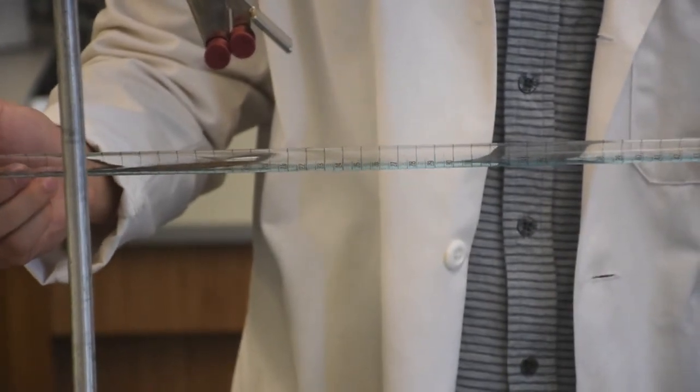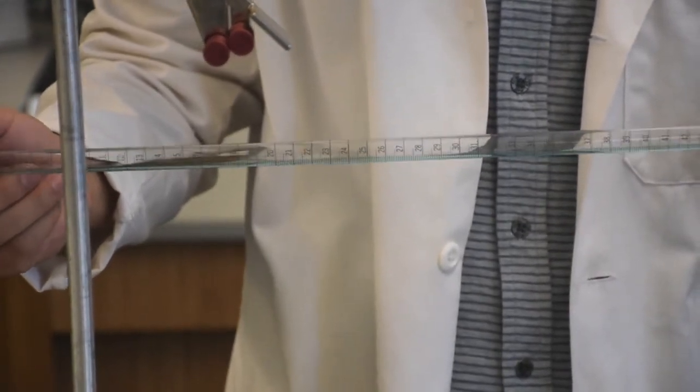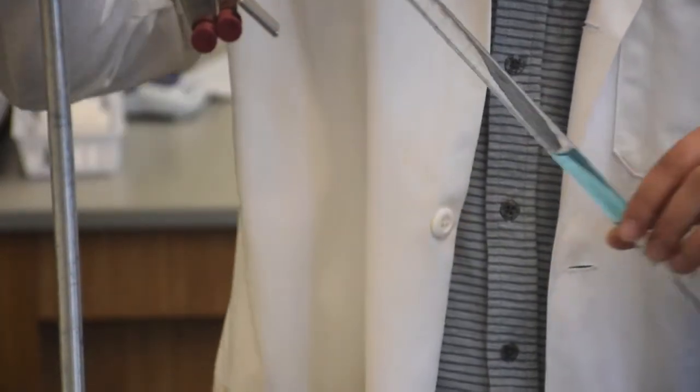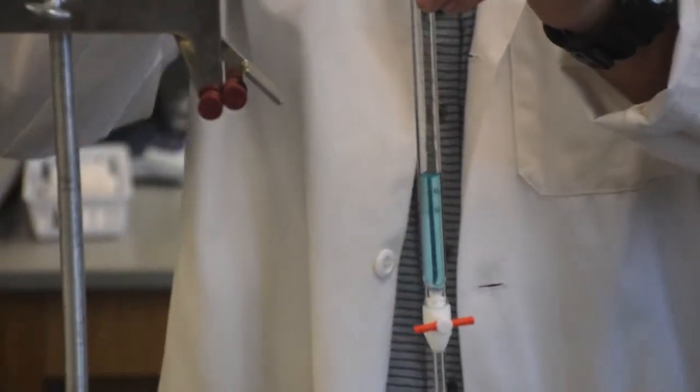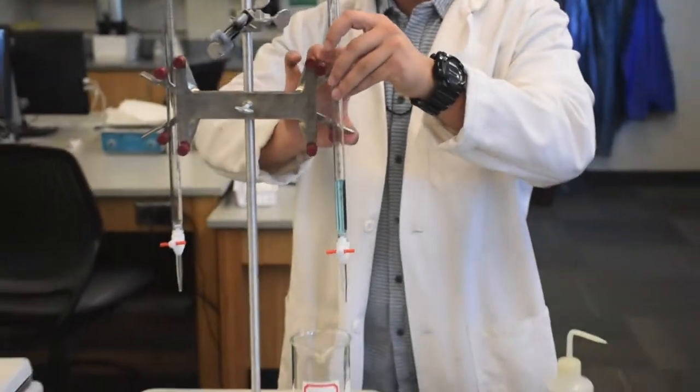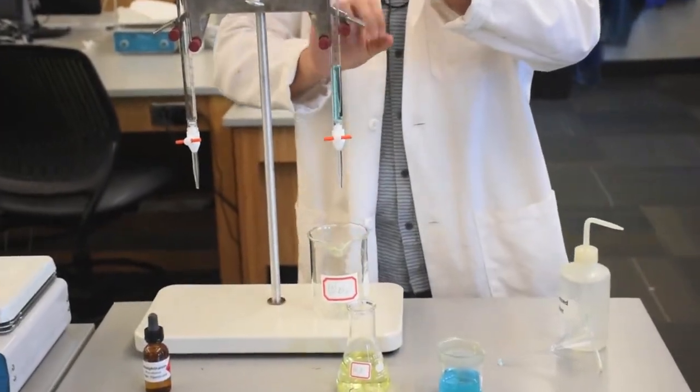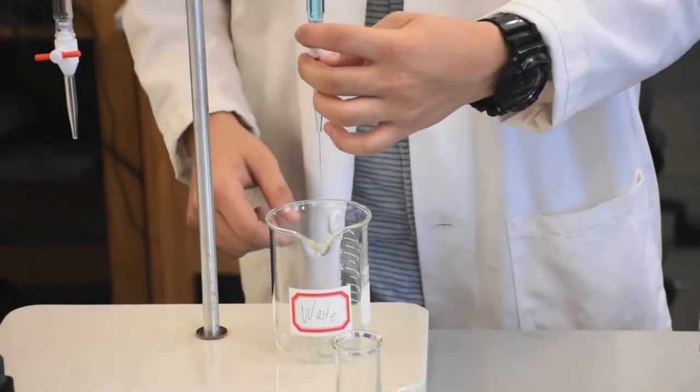In this case, the titrant being used is sodium hydroxide. The last step of washing is essential if you need to be very precise when calculating the concentration of the titrant. Now dispense the last washing into a waste beaker.